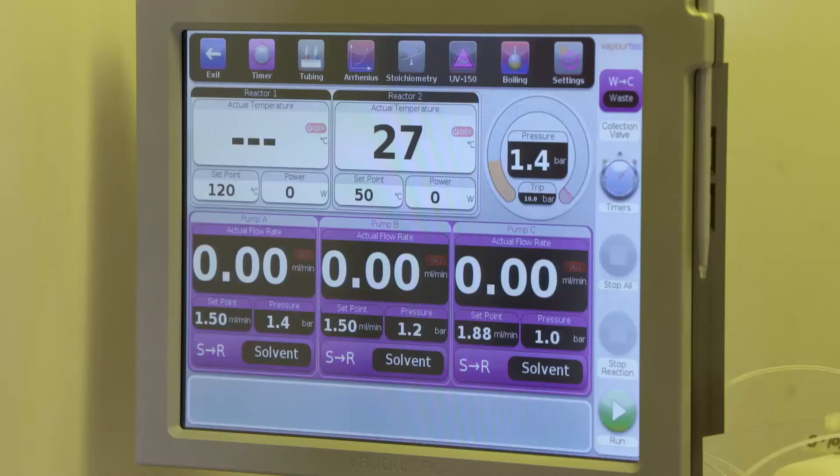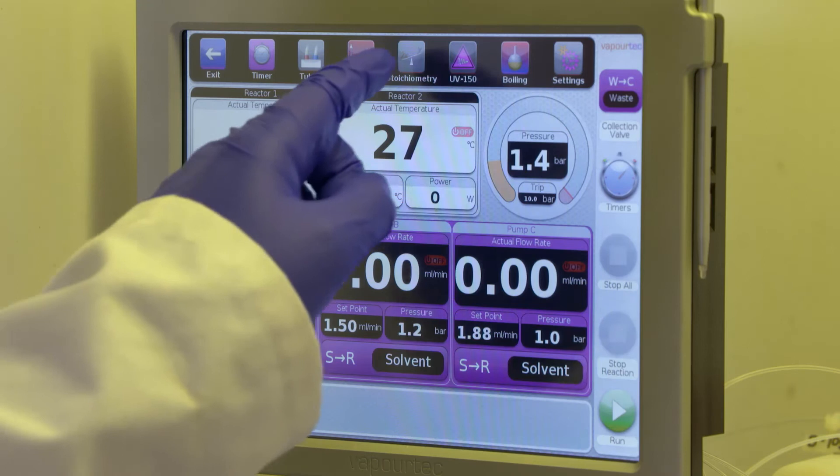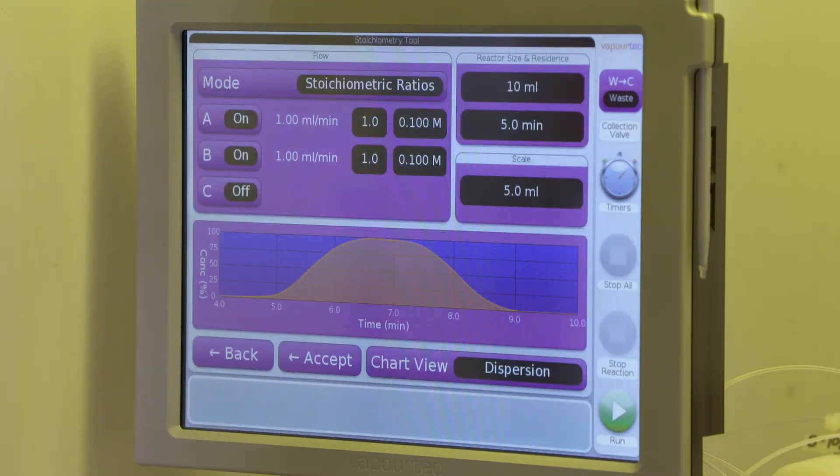So now that everything's ready we can use the software to design and control the reaction. The control software has the stoichiometry tool which includes dispersion modeling which you can use to make sure that you're pumping in enough material to reach the steady state.